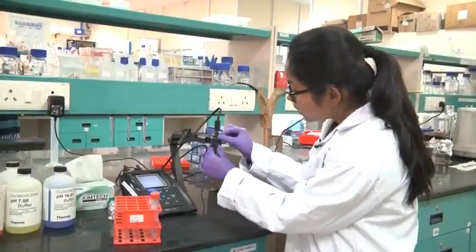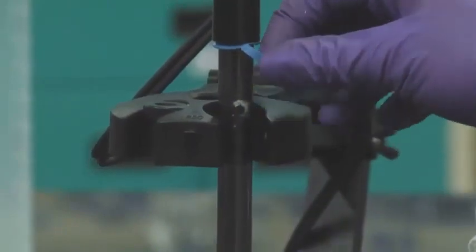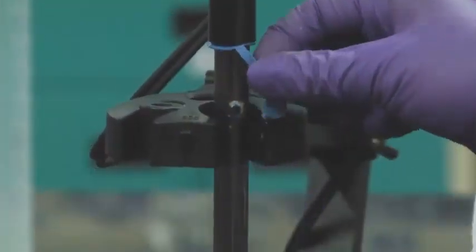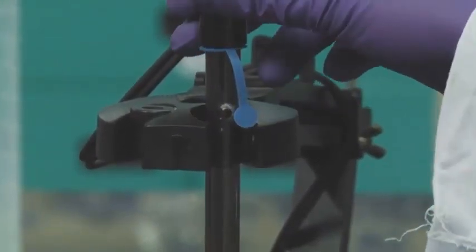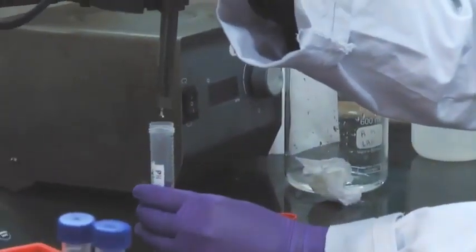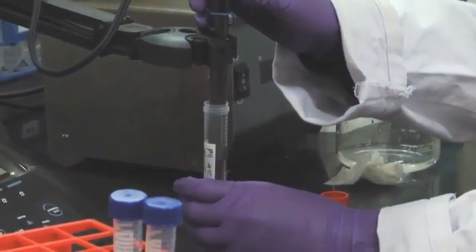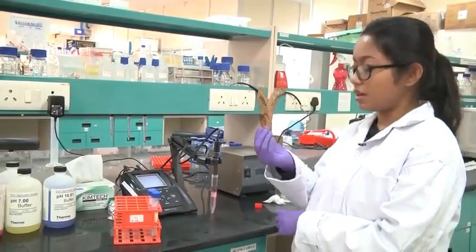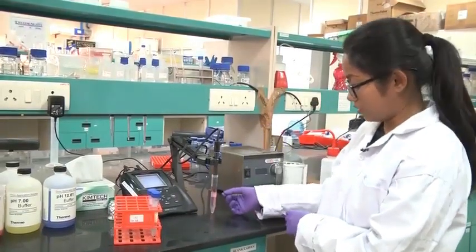And then you open this small cap. This is a refillable probe, where inside there is an electrolyte, a reference electrolyte. Before you start measuring any pH, you should open this knob. Now I am using a standard solution of pH 4.0, and I will dip this probe inside this solution. Be very careful how much you dip the probe. The bulb should be completely immersed inside the solution. Do not dip it too far, otherwise the buffer might go inside your probe. So dip it until the probe is fully immersed.